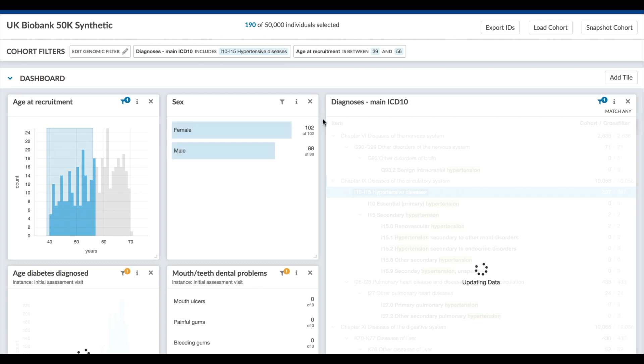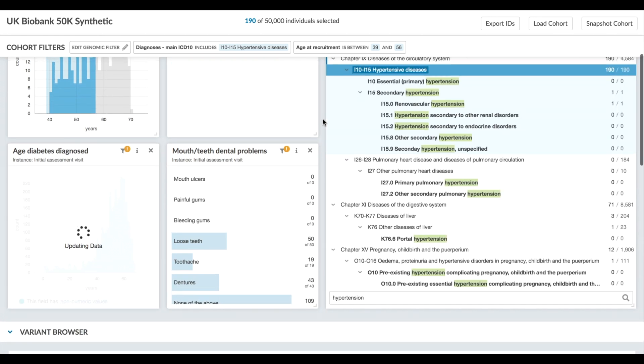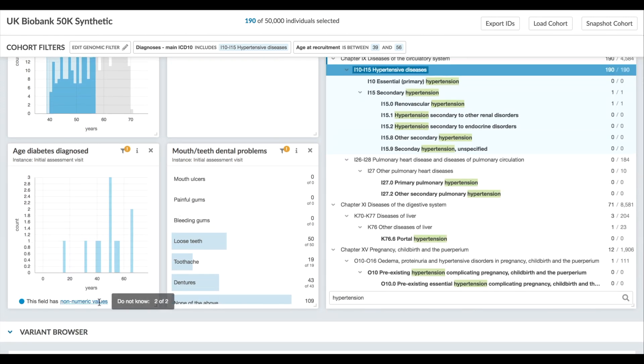All of the tiles update themselves automatically to reflect the new sub-cohort. Now we just see those 190 individuals age distributions, what dental problems they've had, diagnoses, and anything else you've added to the dashboard.